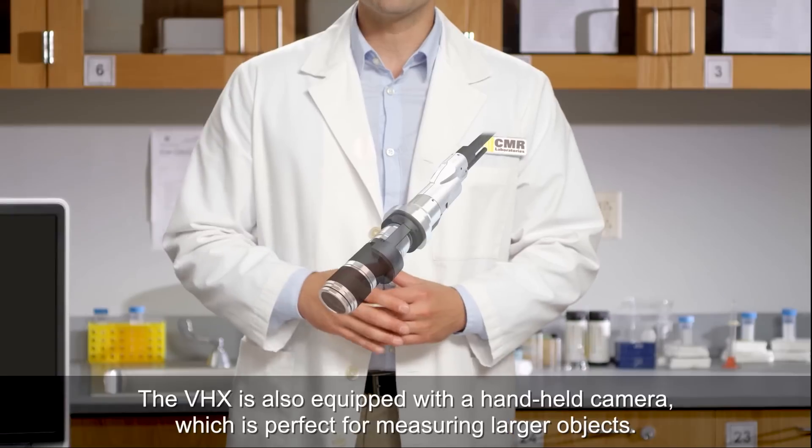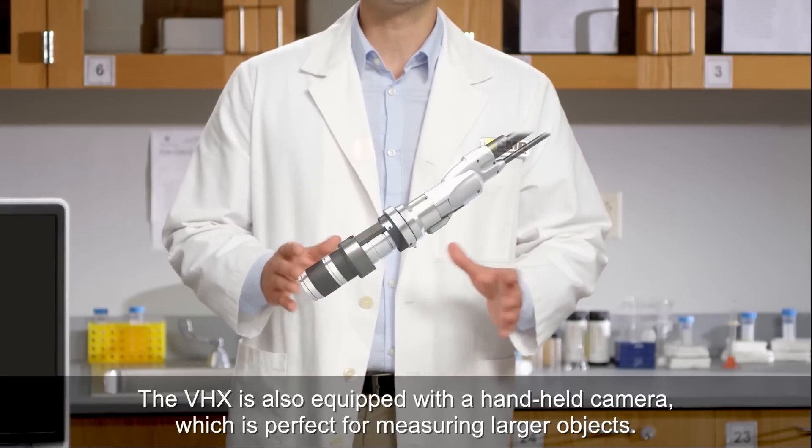The VHX is also equipped with a handheld camera, which is perfect for measuring larger objects.